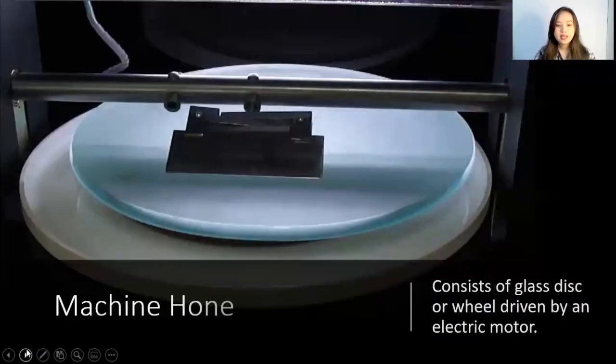Next is the machine hone. So it consists of a glass disc or wheel driven by an electric motor. So the knife is pressed against the flat side of a rotating glass wheel, and the abrasive suspension is made by a mixture of alumina and 200 ml water, allowed to stand before use.